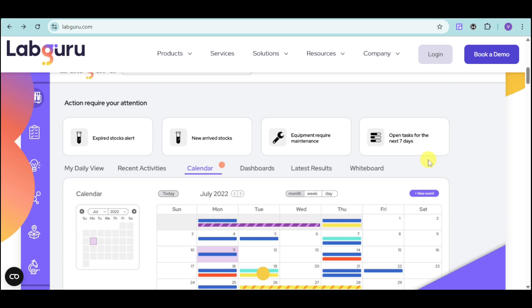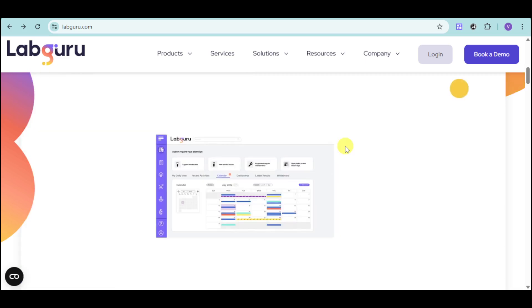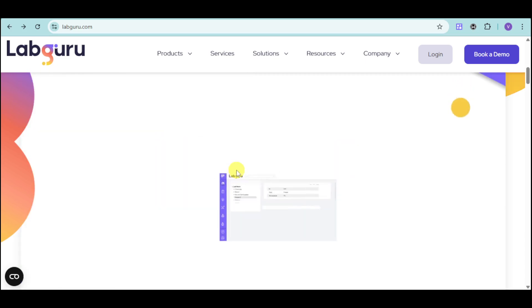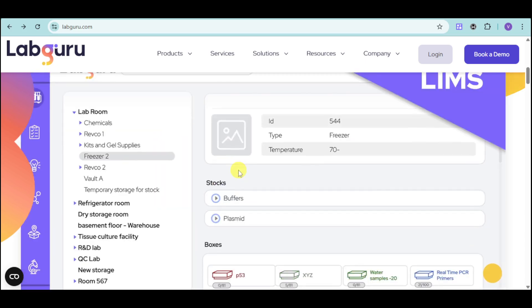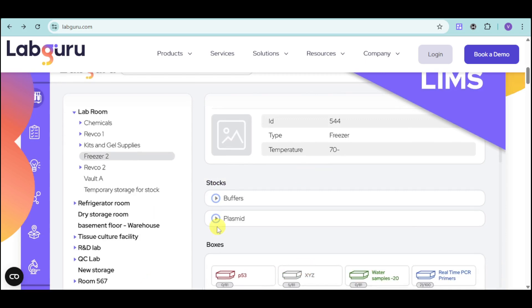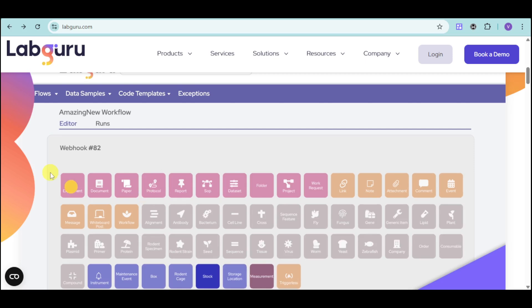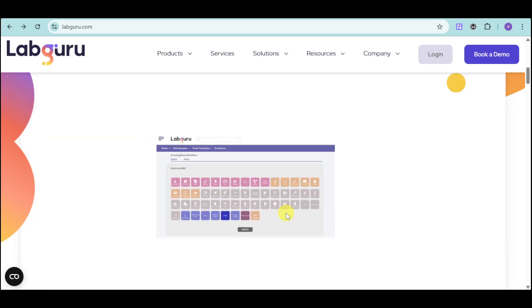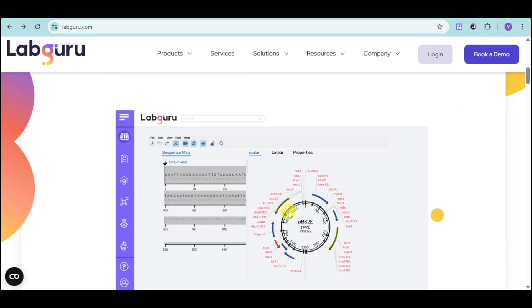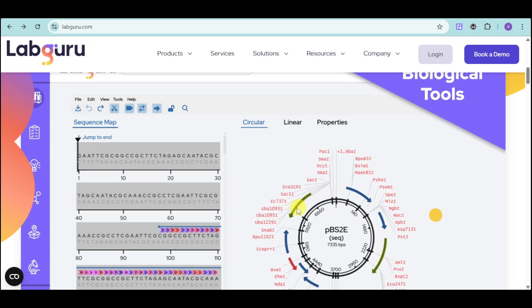Now, here's a quick run-through of LabGuru. We have dashboards. We also have the lab room chemicals, as well as inventory. We also have webhook for different types of data.